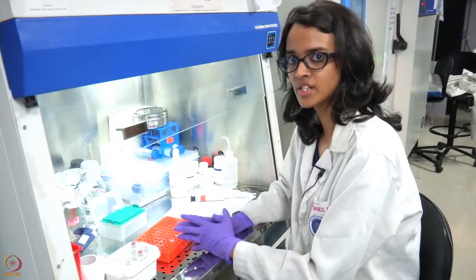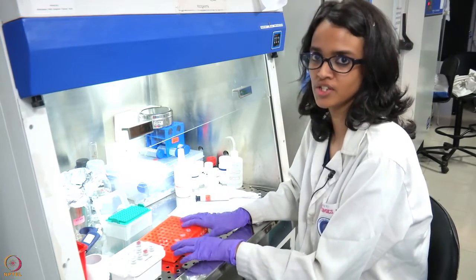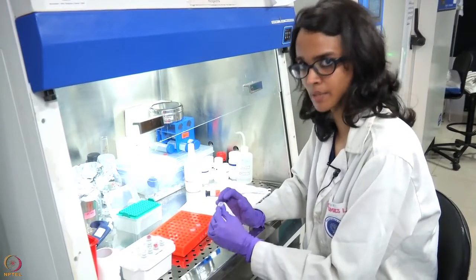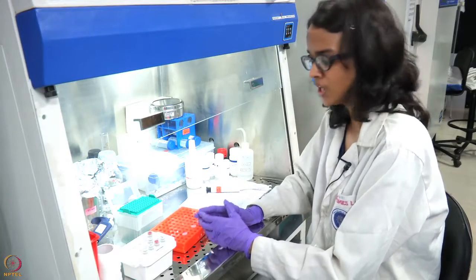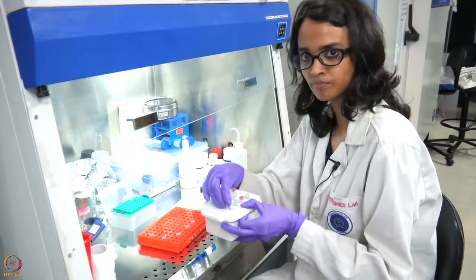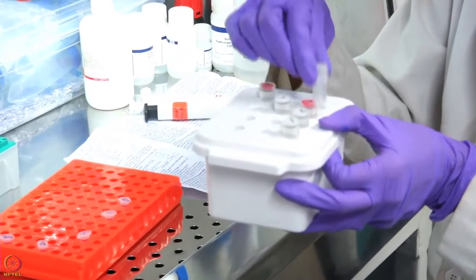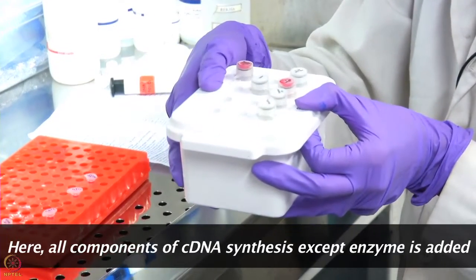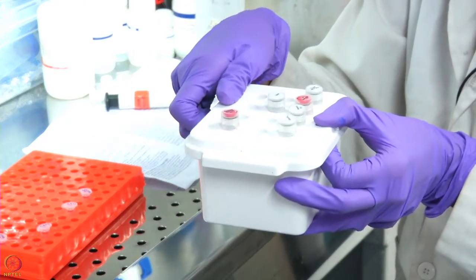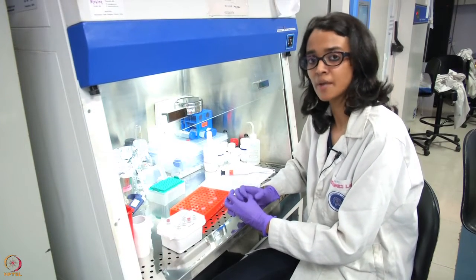As with any experiments, controls are very important. For cDNA synthesis, we have 3 important control reactions to be set along with your sample of interest. The first is the no reverse transcriptase control. This control will have all the components as described previously — the primer, the reaction buffer, the Ribolock RNase inhibitor, the dNTPs, and the genomic DNA-removed RNA template — but will not have the reverse transcriptase enzyme. This control will test for any genomic DNA contamination present in our samples.